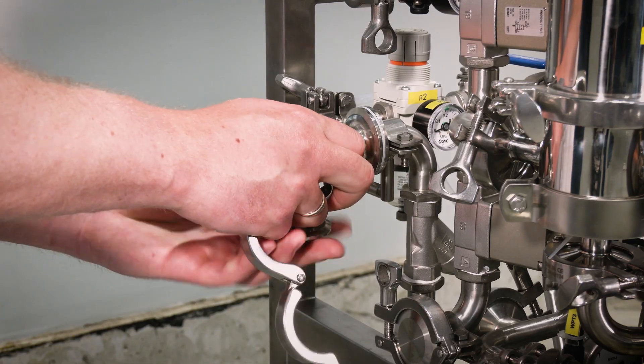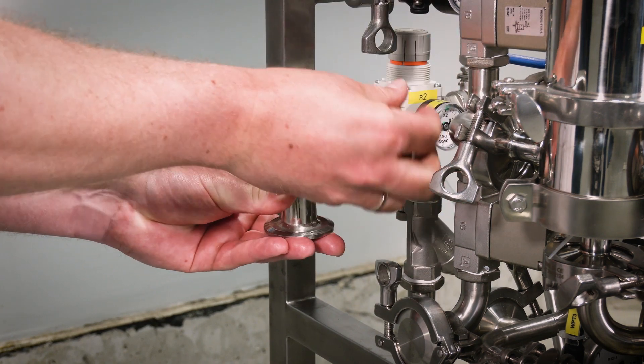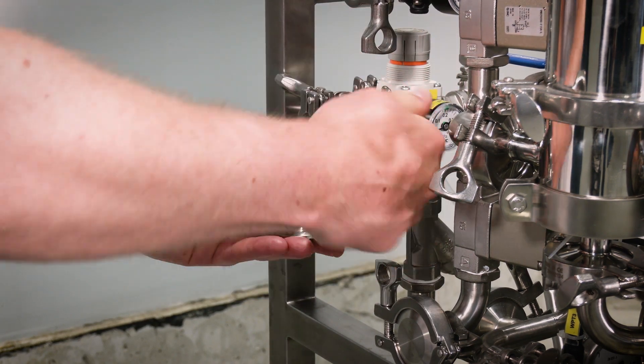Step 3. Connect the steam input to the technological skid and ensure appropriate connection.